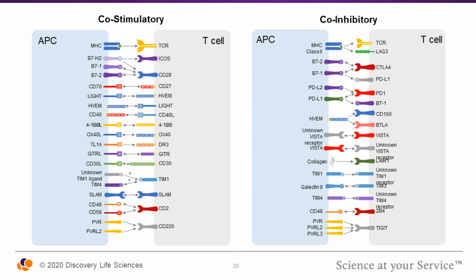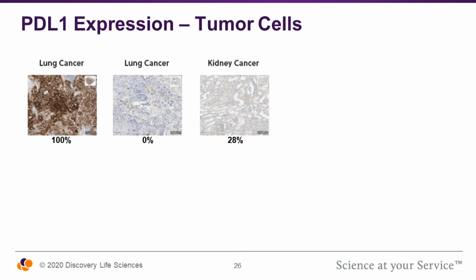After the initial characterization of the DTCs at the cellular subset, we really became interested in looking at what markers specifically T cells express. And this was really driven by the great successes with checkpoint inhibitor therapies like Keytruda and Opdivo. So there are a number of molecules on the surface of T cells that will regulate their activity both in a positive and negative format. So we first focused on addressing whether or not we could identify PD-L1 and PD-1 expression within DTCs to use these to further classify these samples for downstream analysis.